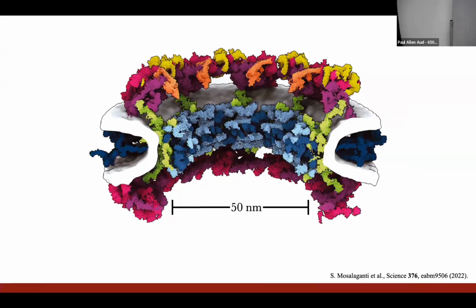How do we do this? We use the much shorter wavelengths of electrons to do high resolution imaging. Now, if you're a biomolecule, an electron coming in at 80% of the speed of light, which is pretty typical, that's bad news, right? So these electrons with doses of just a few electrons per square angstrom basically break every chemical bond in something like a protein.